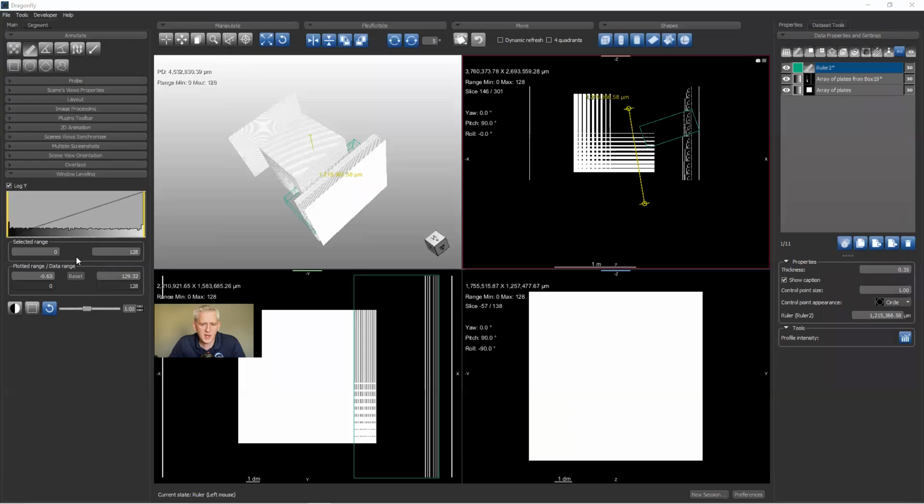All right. Next question. Can we select what the interpolation type is in the rotation? What is the default? So no, you can't. We should add it. If you send me an email, I might just put a note in our requirements database so that it gets added, because it's an hour task for someone to add it.